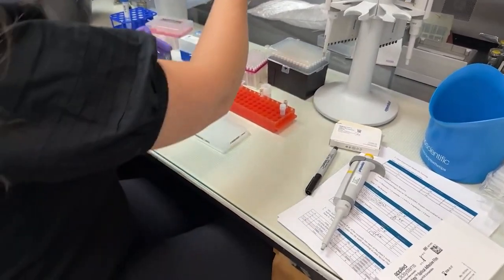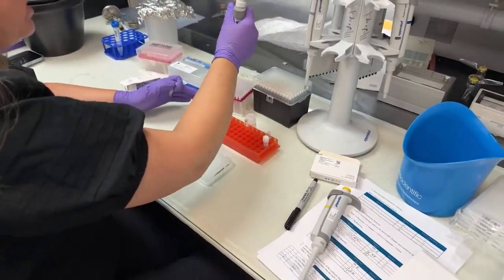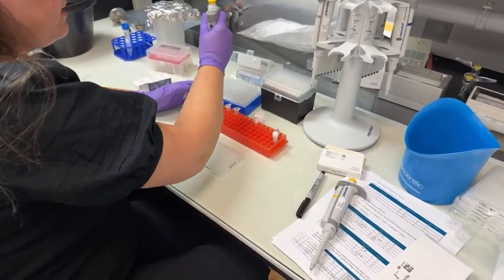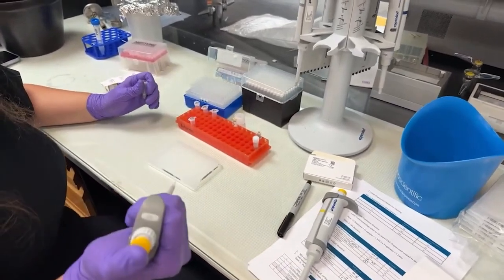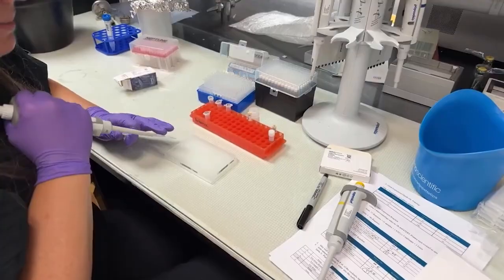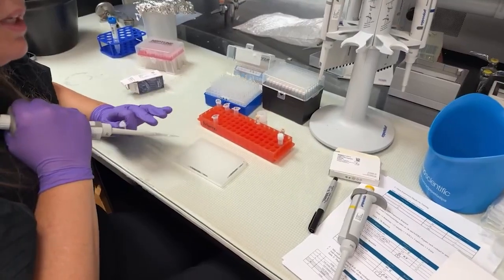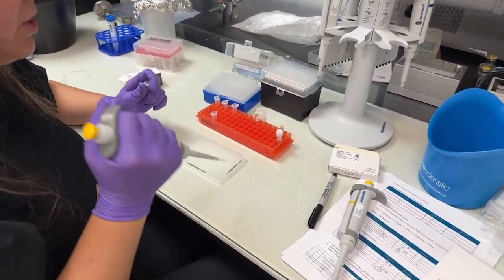Number one, it ensures that the reagents stay clean, so I'm not putting contamination into the reagents I want to keep reusing. Also, sometimes liquid or other items can hang on inside the tip, so if you're doing repeated pipetting steps, they can become inaccurate.